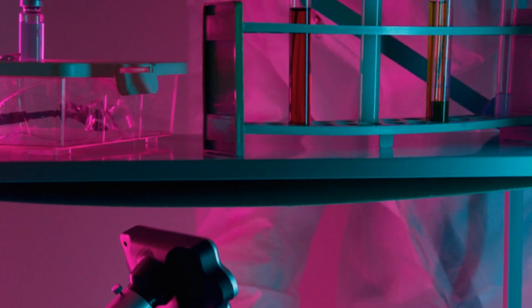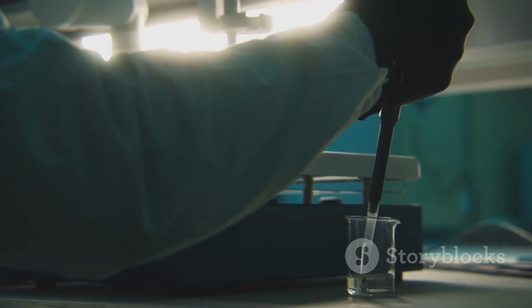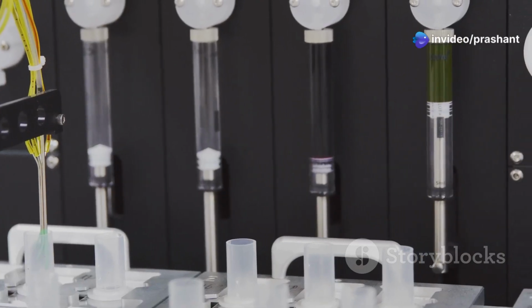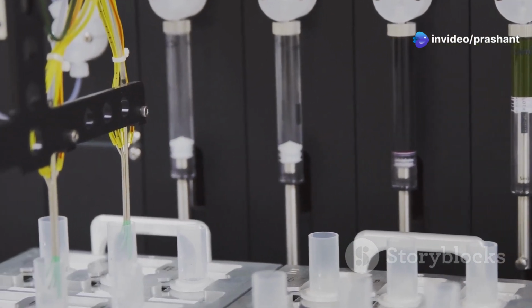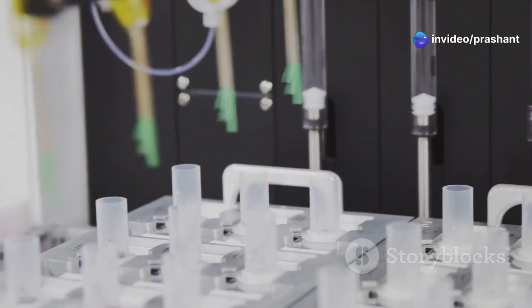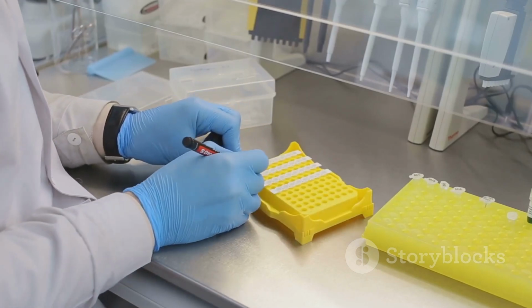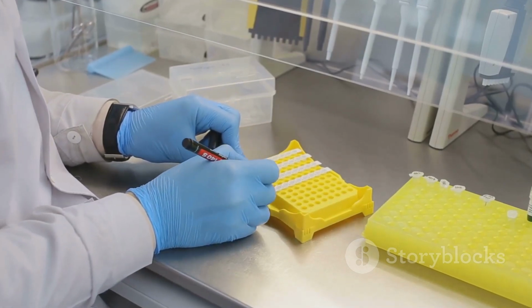After a set period, the separated molecules form distinct bands in the gel, which can then be visualized using staining or UV light. This separation process is useful for identifying and analyzing proteins, nucleic acids, and other biomolecules. It's essential for DNA fingerprinting, protein purity analysis, and genetic studies.